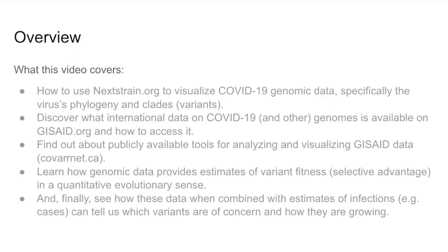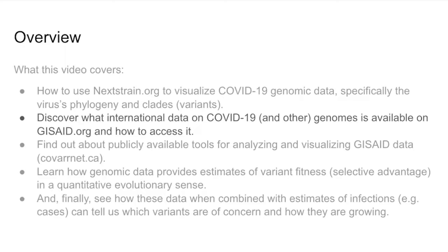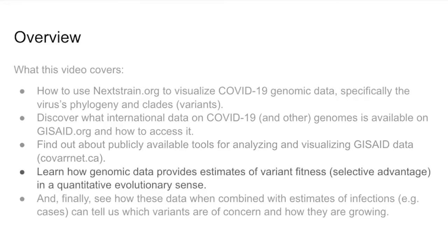Let me recap what we've talked about. We looked at how to use nextstrain.org to visualize genomic data. We also saw how to access COVID-19 genome data on GISAID. We looked at some publicly available tools for analyzing and visualizing that data, and we saw the concept of selective advantage and how we could use the analysis discussed to determine what's actually going on. Even if we don't have direct estimates of number of cases of each variant, we can back that out from the analysis here in combination with some estimate of infection. I hope this has been useful and gives you more insight into some of the work that we've done and makes a bit more sense of the reports we've been producing over the last two years.